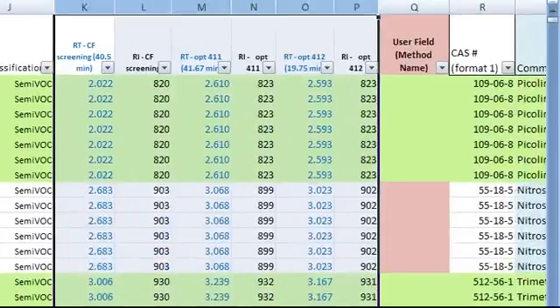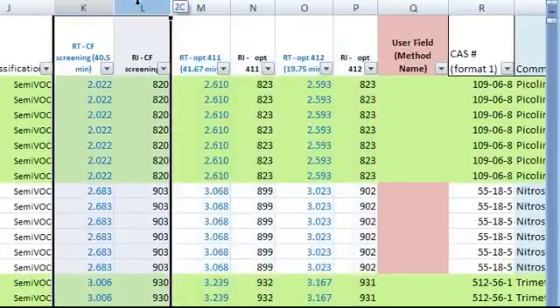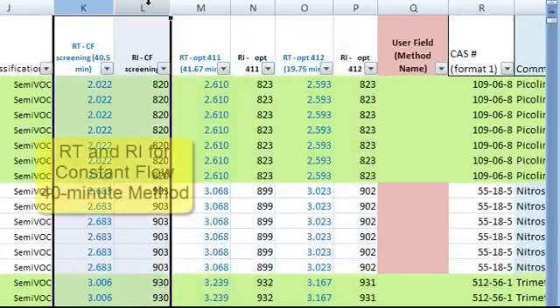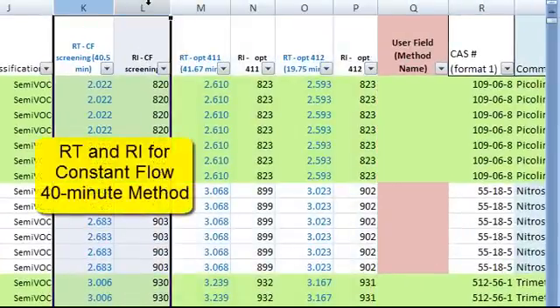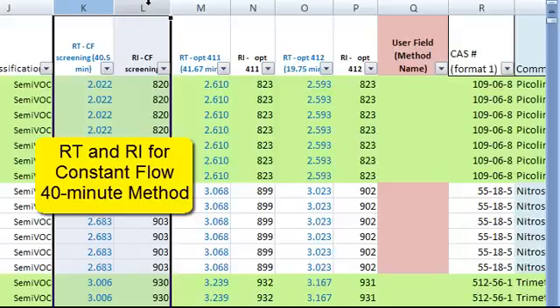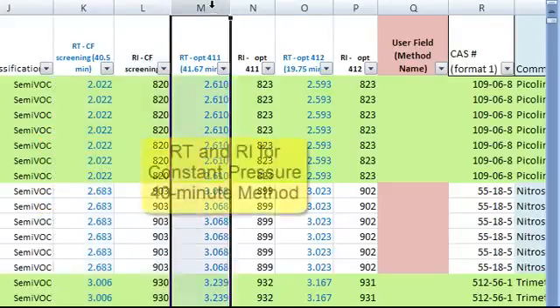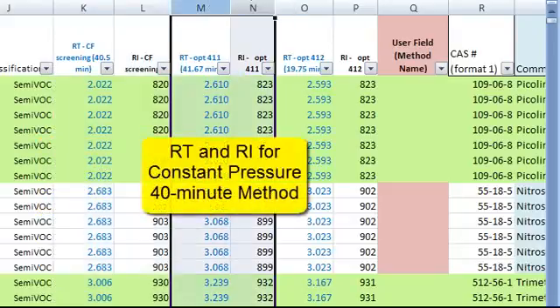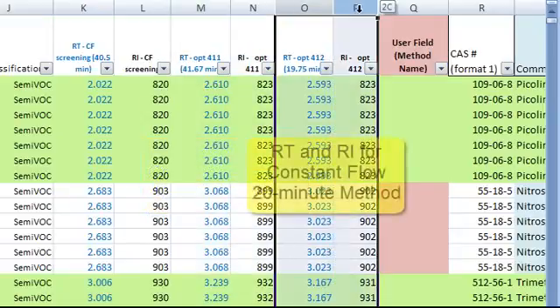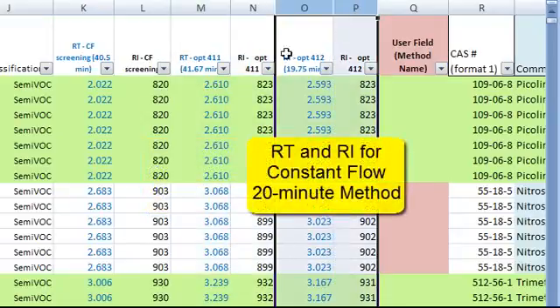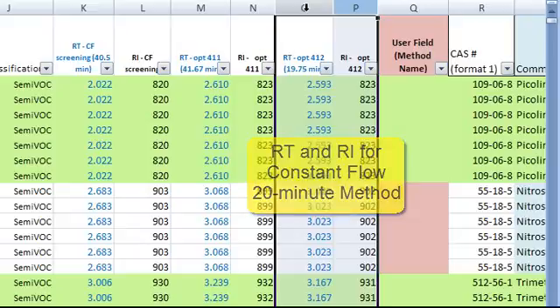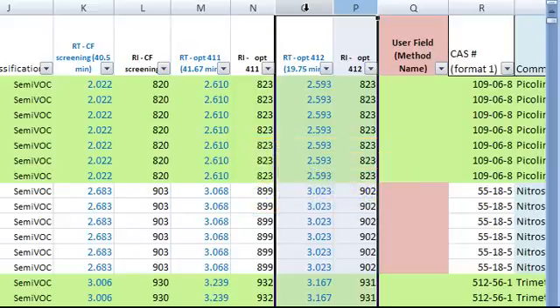These two columns are the retention times and retention indices for the constant flow 40 minute method. These two are the constant pressure 40 minute method. These two are the constant flow 20 minute method. This table is currently sorted according to the retention times of this method.